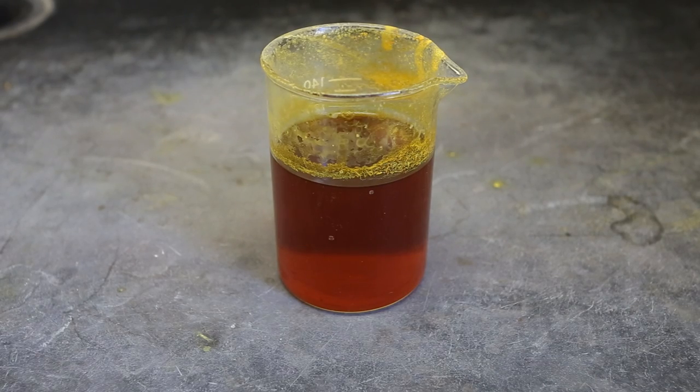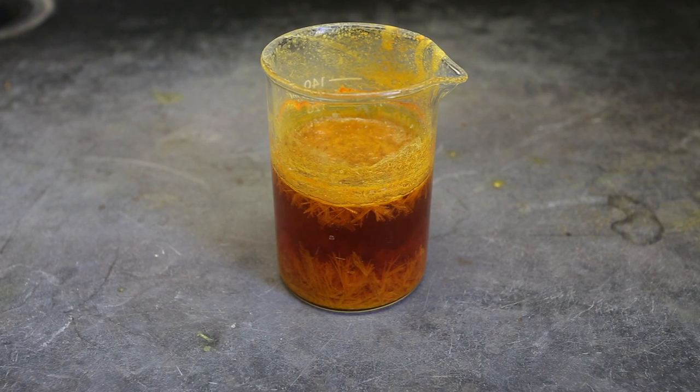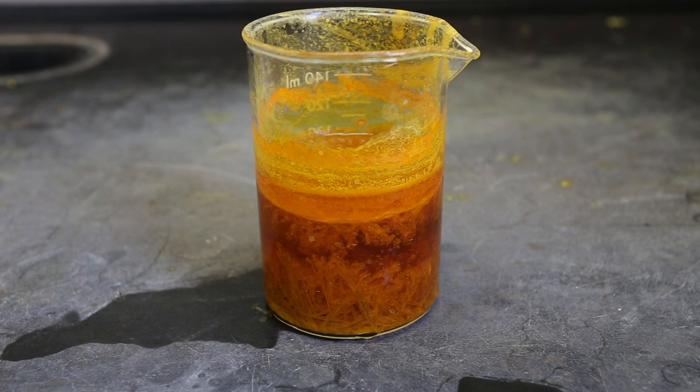Once all the product had dissolved, the solution was removed from heat and allowed to cool to room temperature. As the solution cooled, it was possible to see nice, clean, yellow P-Nitroaniline crystals crystallizing out of the solution. Once the solution had reached room temperature, it was placed on ice. This is what the final crystallized product looked like in the beaker.